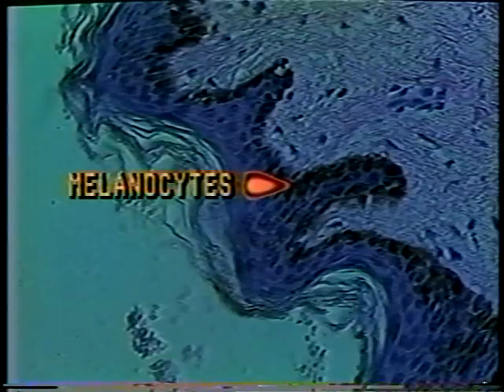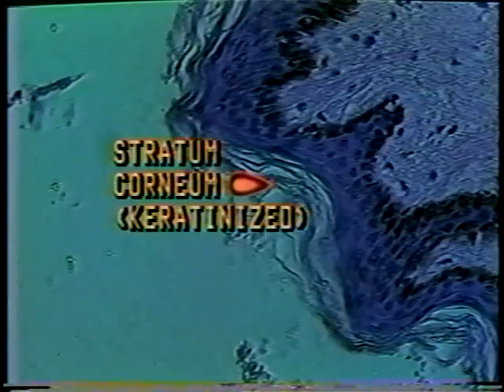This slide of negroid skin allows one to clearly see the melanin-filled melanocytes. The melanocytes of Caucasian skin are usually only visible when the skin has been exposed to ultraviolet light and is suntanned. The outermost layer of the epidermis consists of dead cells that make up the layer known as the stratum corneum.